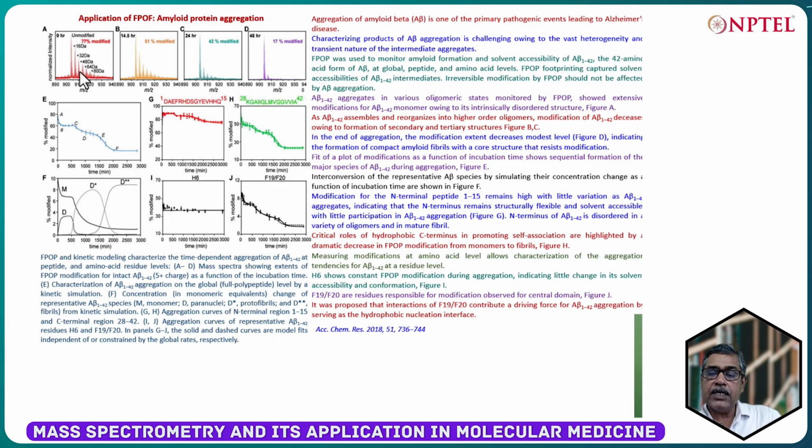So, several different conformations are possible that can ionize with different charge states, which is visible under mass spectrometry conditions.